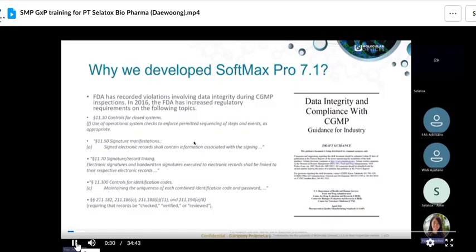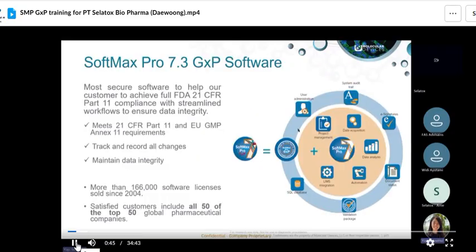focused. All right. So I will go ahead and talk about SoftMax Pro. From version 7.1 onwards, for Molecular Devices, we have made more changes. One of the key critical changes is we store everything in a server-based method, which is a SQL database method. Whether you get the single computer setup or the server setup, you have this SQL database project management.